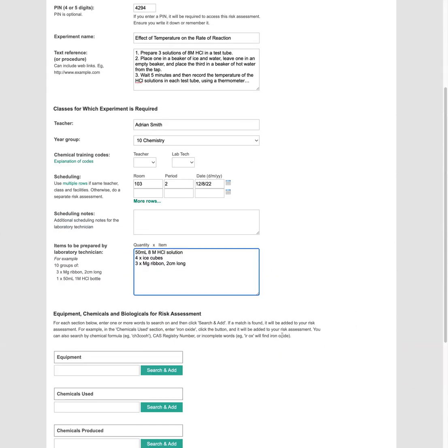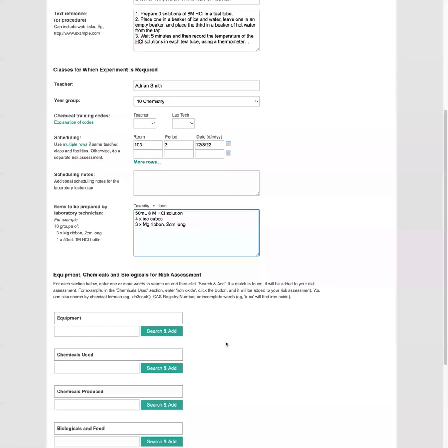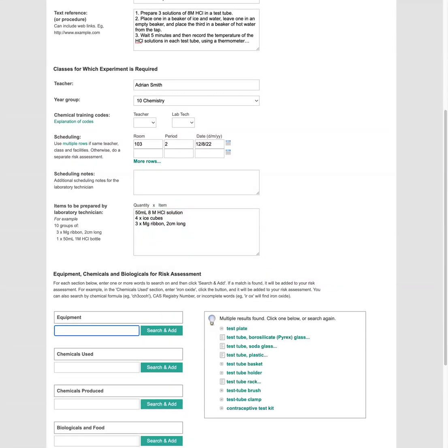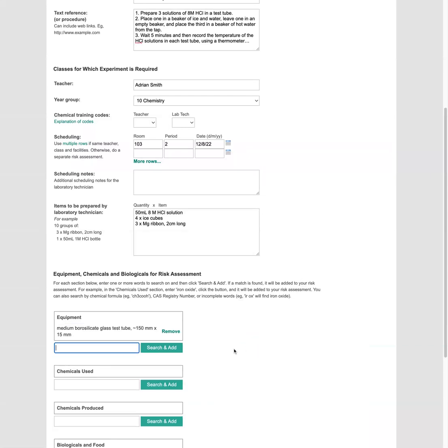Now let's search for the items that we're going to be using. So we'll have a look for a test tube. You can enter in just part of the name or the full name. So test tube. We want to go for a medium sized one.